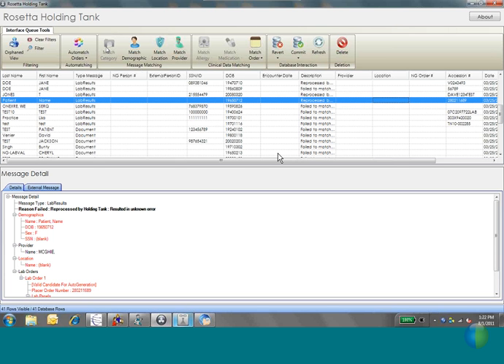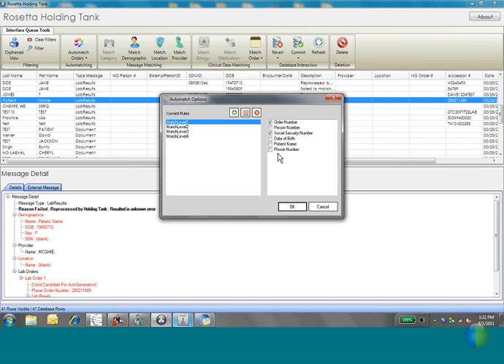So first option is the auto match, which is this button here with kind of the circle and the colors. You can go to auto match and you can create options. And the options I've already done, but you can create levels to use these individual options. And remember again, if it matches by order number and person number, it won't be here. But let's say instead of person number, you can match the order number and the social security number.